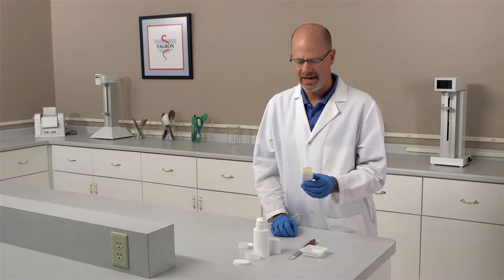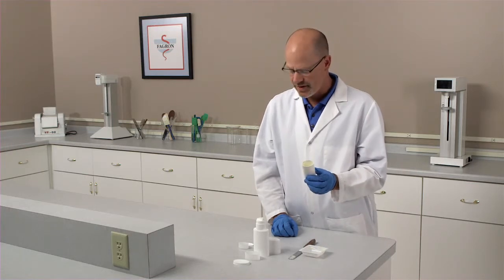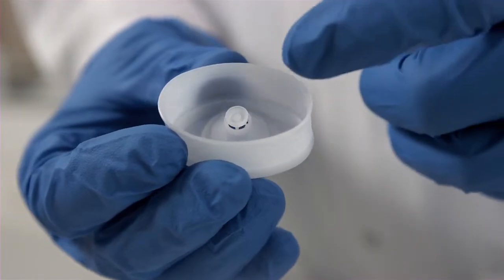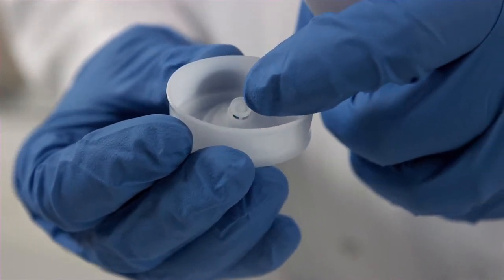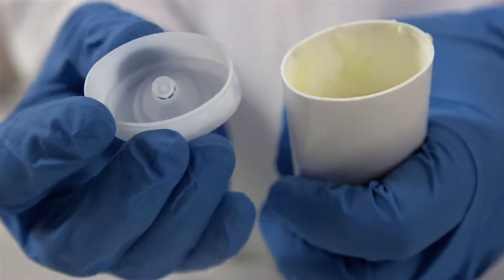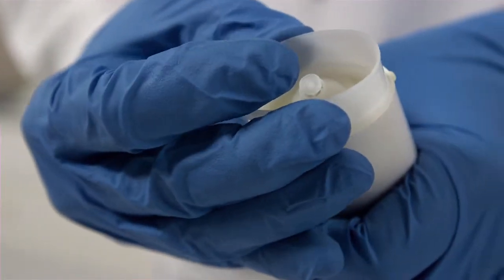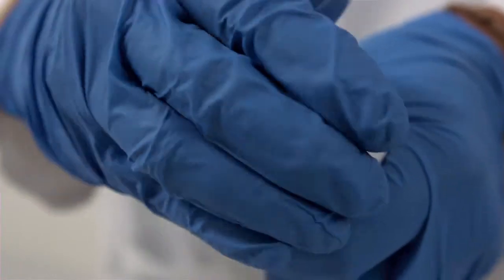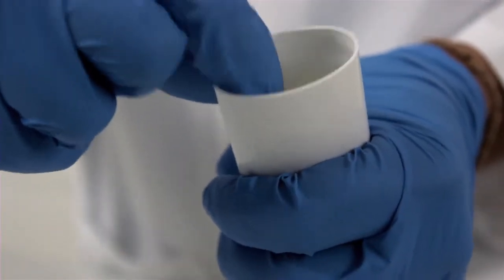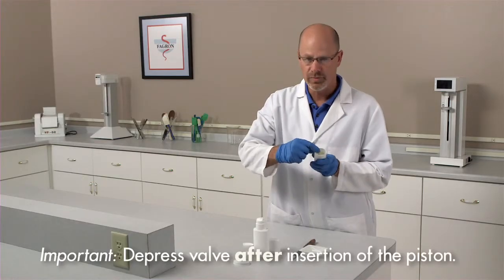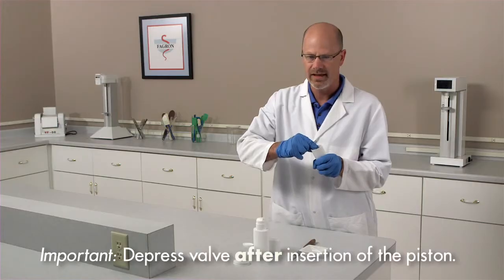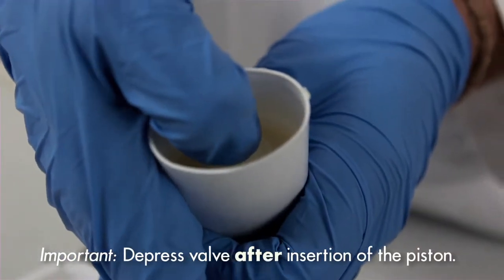Once the cream base has been filled into the dispenser, we can now insert the piston. What's important is this little valve must be plugged in order to pressurize this dispensing system. Simply place the piston with the valve facing you, facing out. There's a little device or plug that needs to be pushed in order to pressurize this system, and all you do is push and snap it in place.